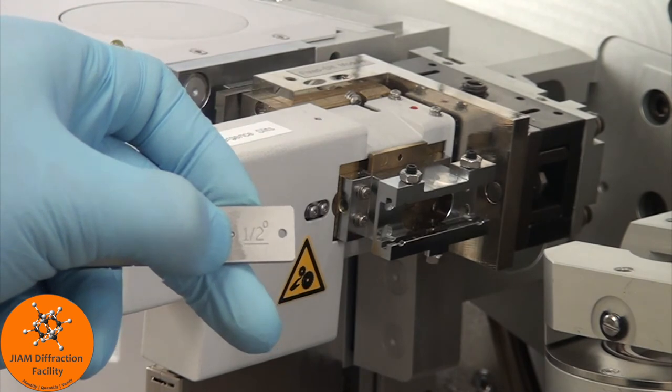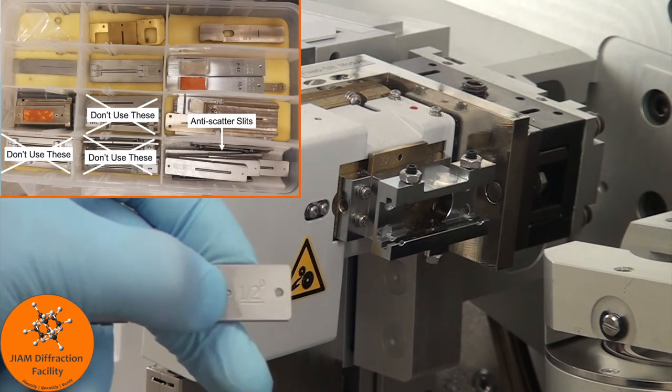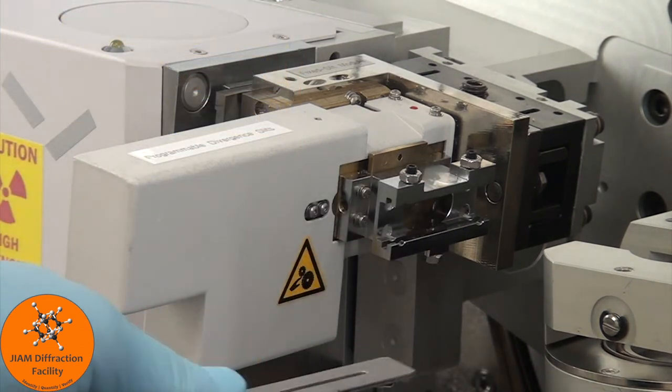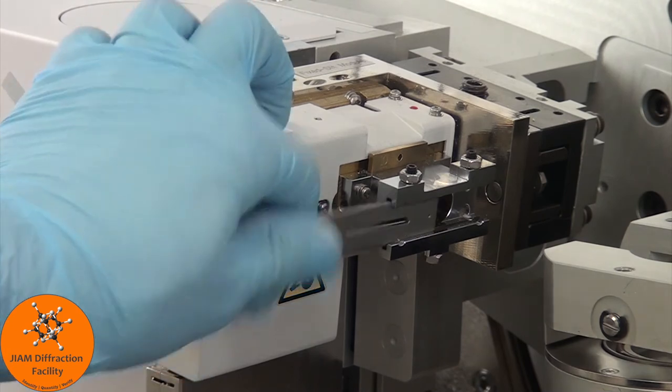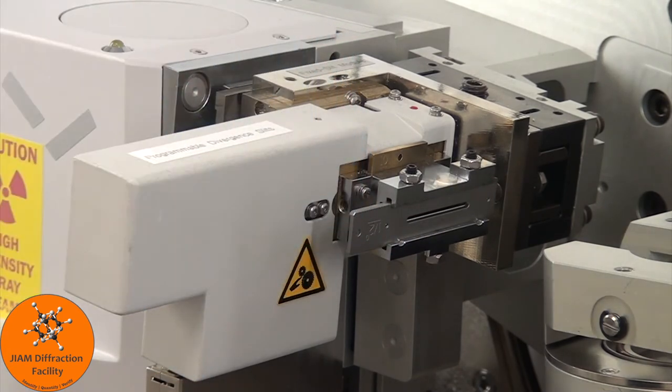If you need a different size, they are also located in that small plastic bin, which you should see on the top left of your screen. And if you need to put a new one in, simply insert it all the way, and then pull back until you feel and hear the click.